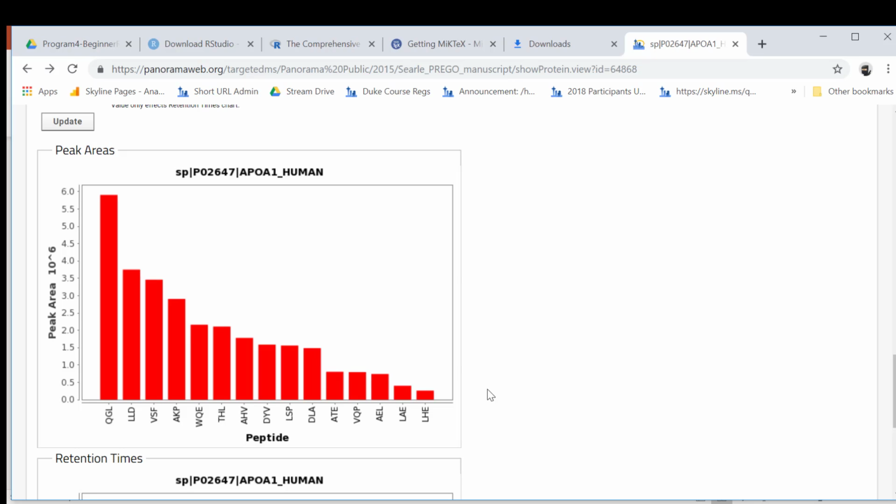So this might get closer to the question of data mining. I don't think we have any web scrapers for this yet, but if you want to build one, that'd be great. Yeah. There is actually MRM Assay DB, can go to PanoramaWeb. Oh, can it? MRM Assay DB is a scraper for Panorama? Nice. So you don't even have to build your own scraper.